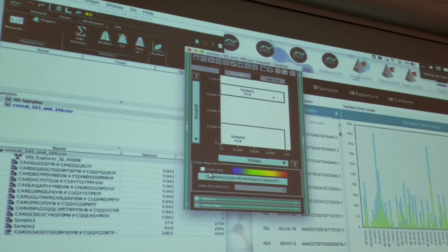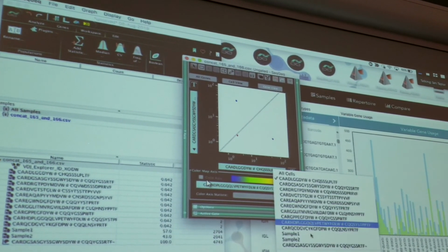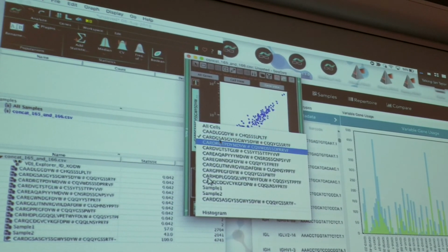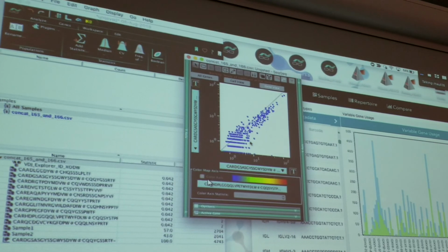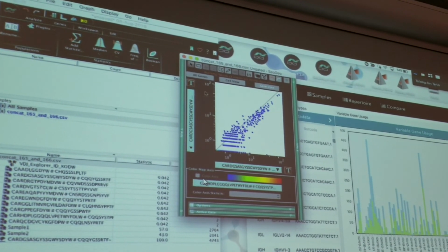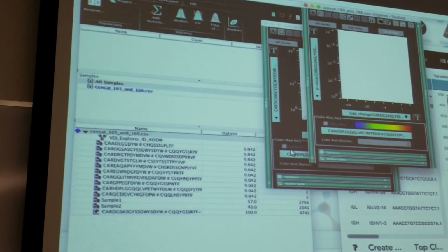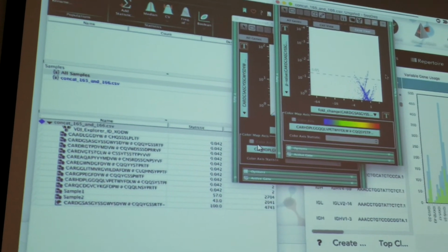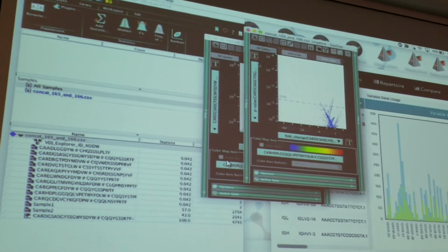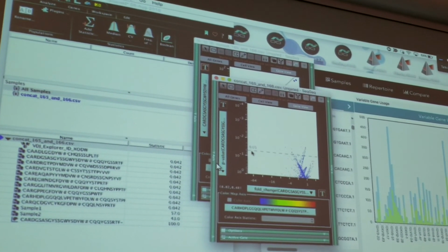I'm going to switch to gene view because we're asking about differential expression. And then as a test, I'm going to use my not gate here and compare it with this guy. So there are some genes that are overexpressed in that clonotype relative to the rest of the data. And now if I go into the volcano plot, whoa, it looks funny. It does. I don't know if I've seen something quite like this.